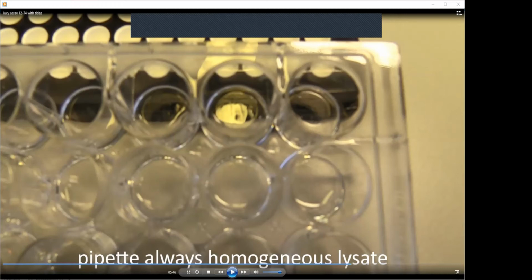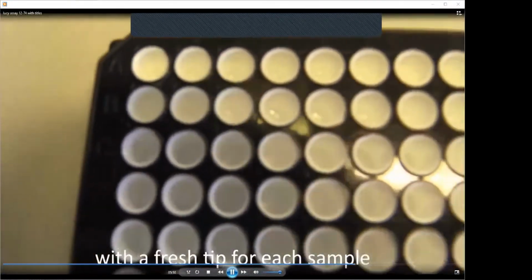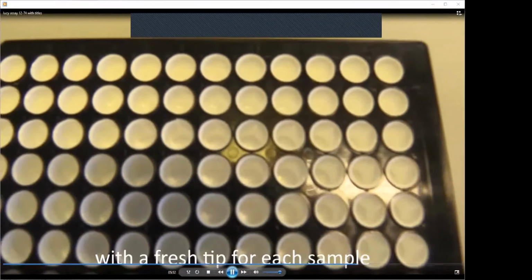So either you decide to use only the liquid part, or you also pipette it as long as the cells are homogenized and you have always the identical type of lysate. Then don't forget that for each sample, a fresh tip has to be used in order to have really individual samples to calculate the mean value and not to contaminate with the neighboring samples your new sample which will be measured.